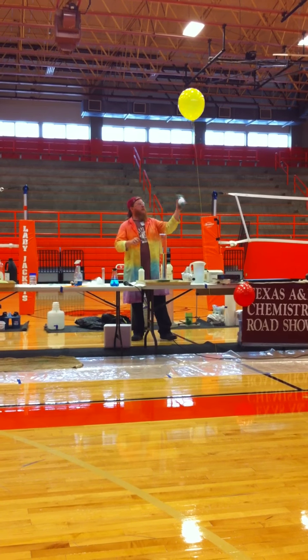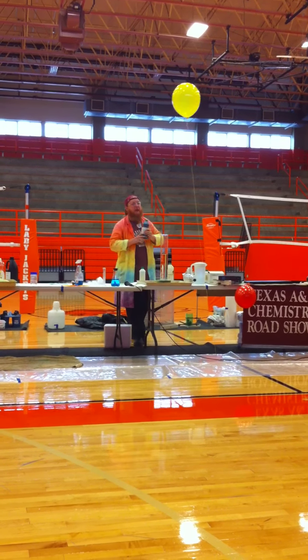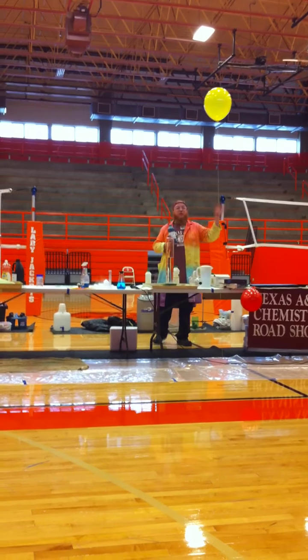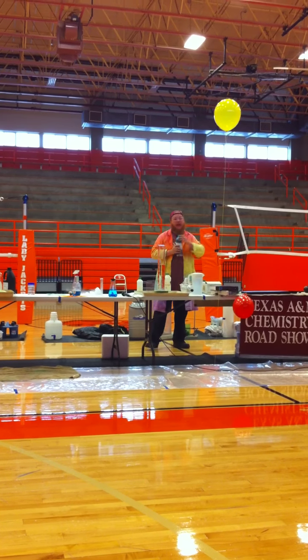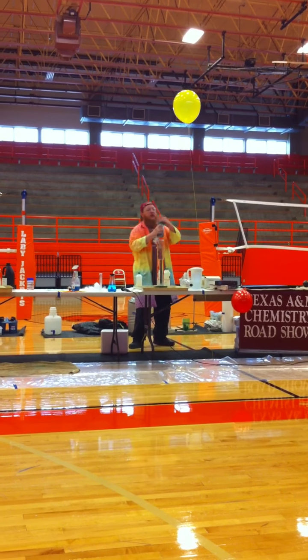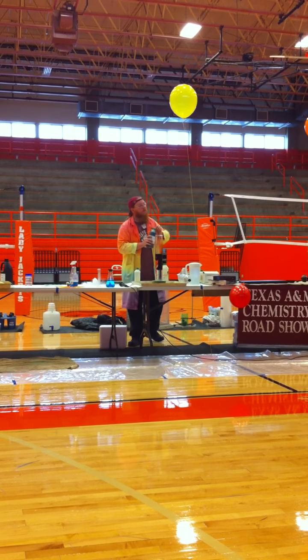It's a little bit hard to see from up there, but it's called a universal indicator because unlike the goldenrod paper here that does one color change, it goes through a whole series of color changes. So based on the color, we can tell approximately how acidic or basic it is. Again, under neutral conditions, it's kind of this sort of greenish color. Under basic conditions, it turns really pretty purple.